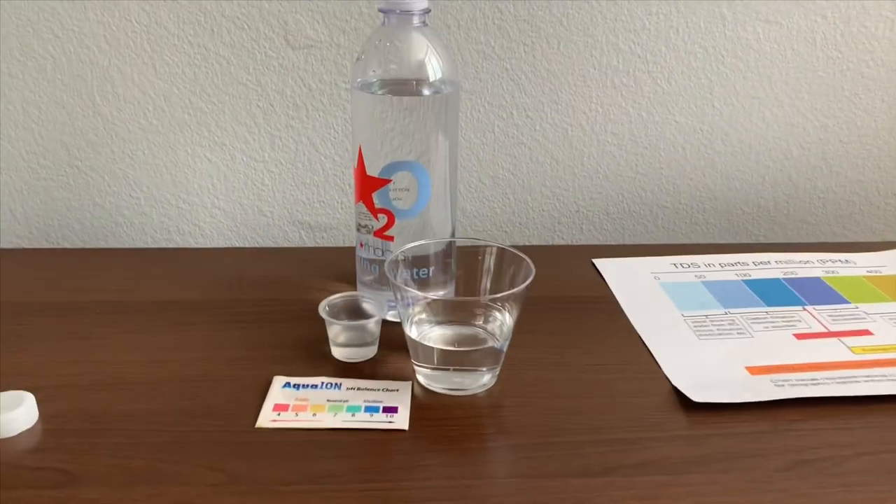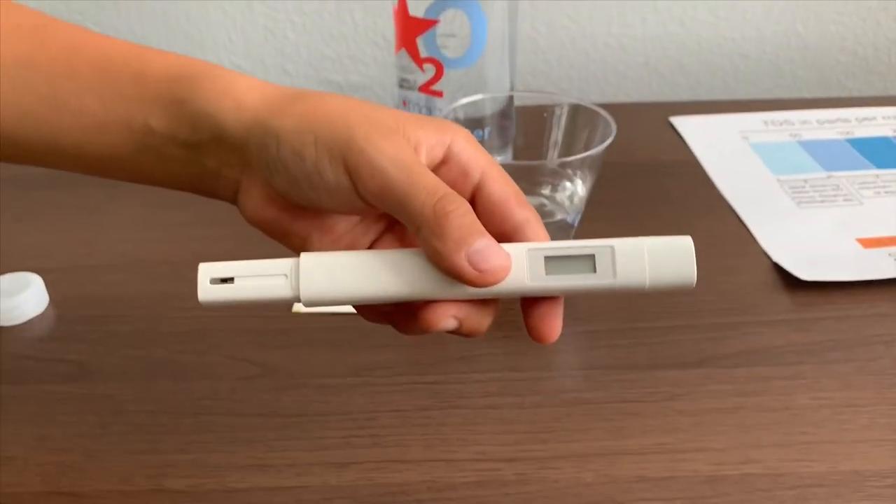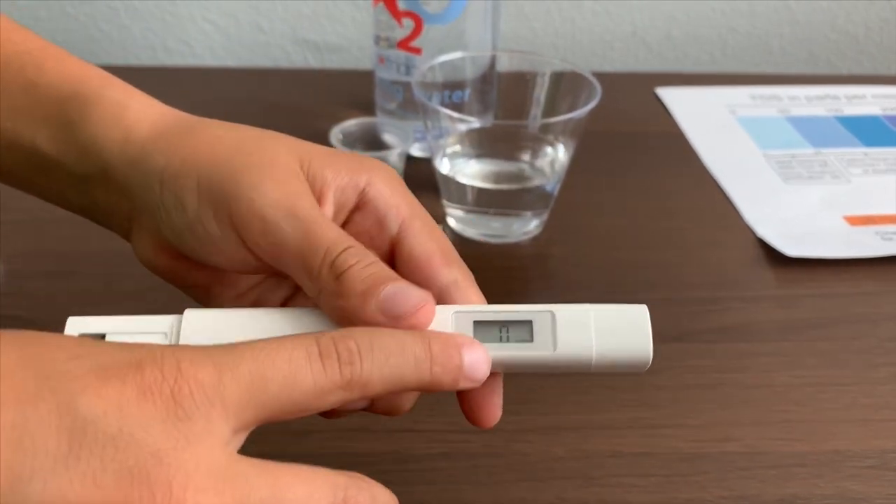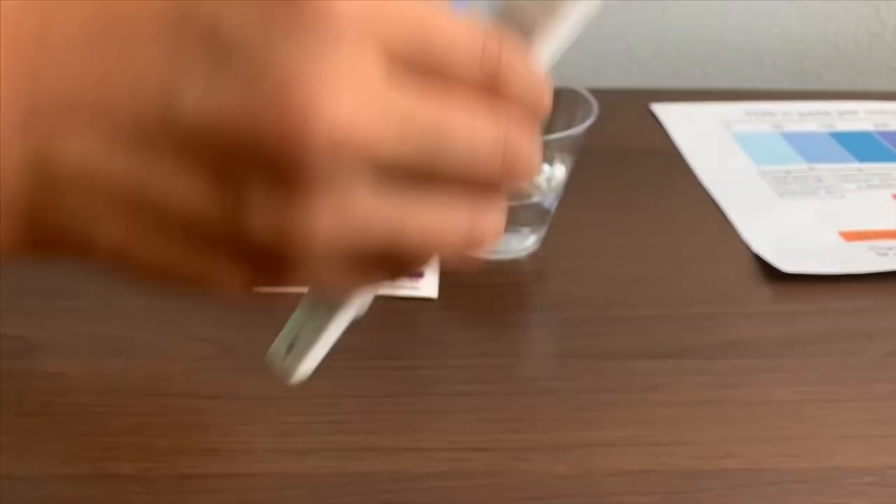First, we're going to test the TDS level. If you want to buy this TDS tester, check the link down below. Turn on the TDS tester, make sure it says 0, and put it in.